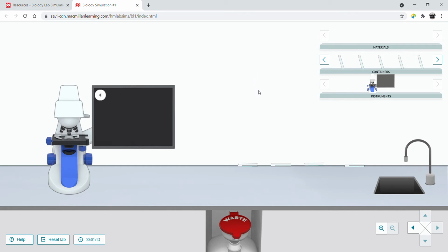this is another lab for you. And this one's going to be a little different if you're using these videos. This one will be a little different than the other ones, but that's okay. We'll just go right along with the procedures.